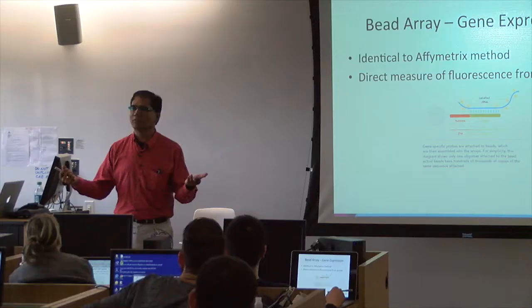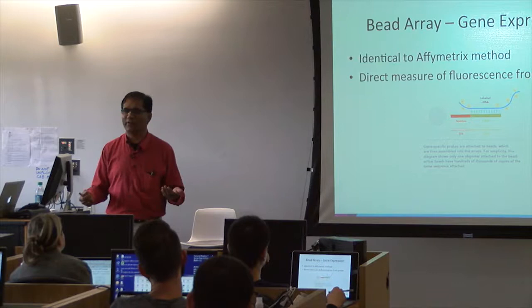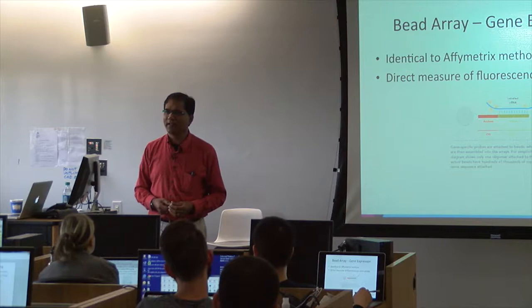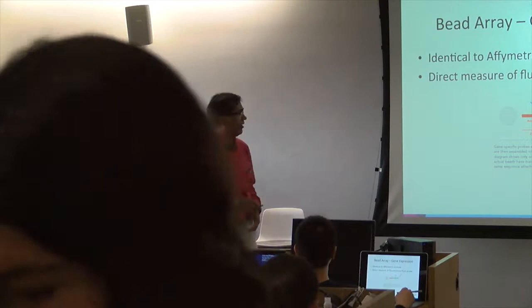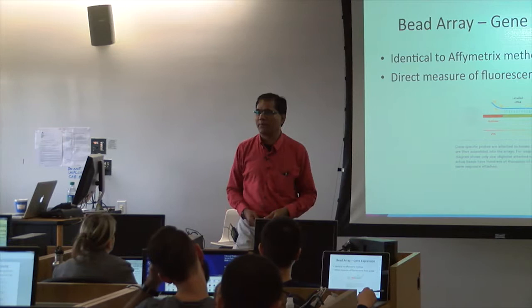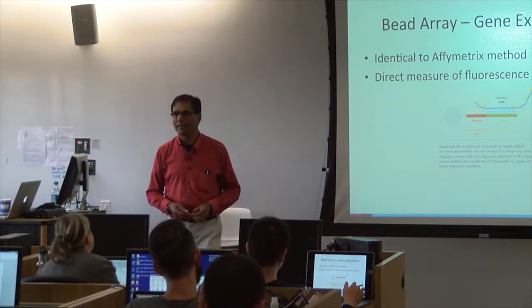We can do that too, depending on the companies, what they can do. That's a good idea. Yes, different ones you can add. Depending on the company, if they say that we have developed this and converted to cRNA, they might have done that. Sometimes RNA-DNA hybridization is much stronger than DNA-DNA hybridization, or making that into 5' to 3', they have to go back and make the minus strand on that. So depending on the convenience of the particular companies, they make it. You can do that. Yes.